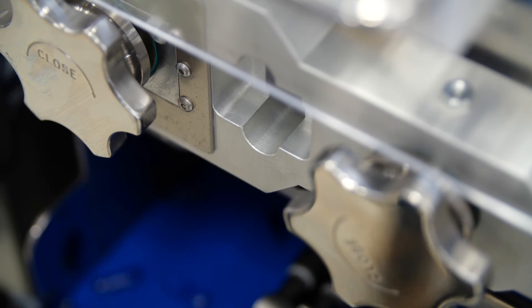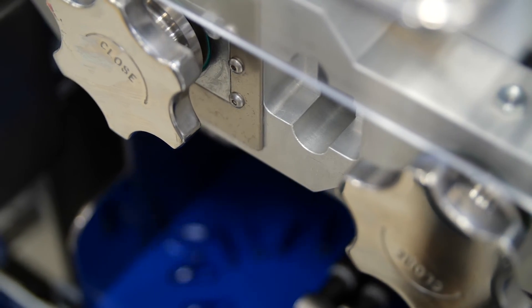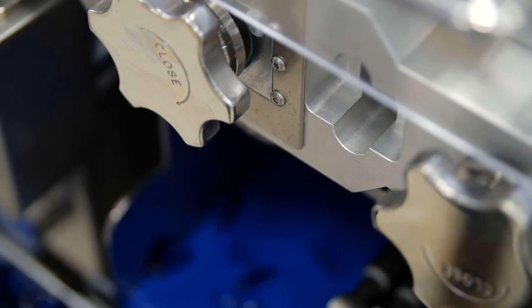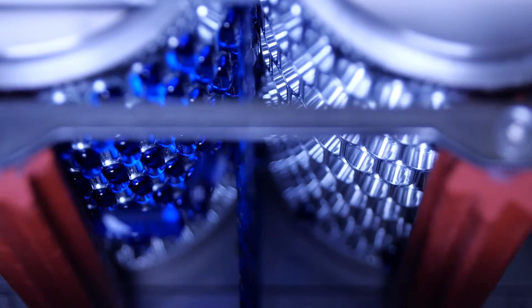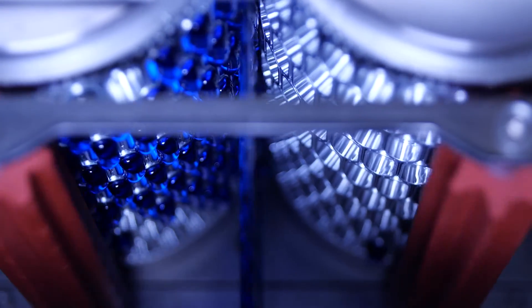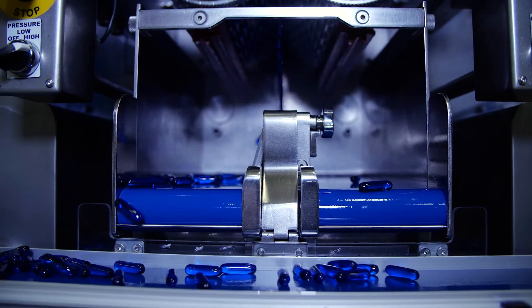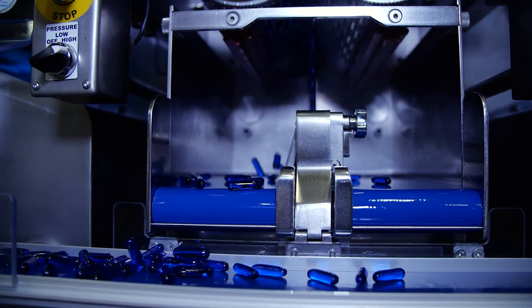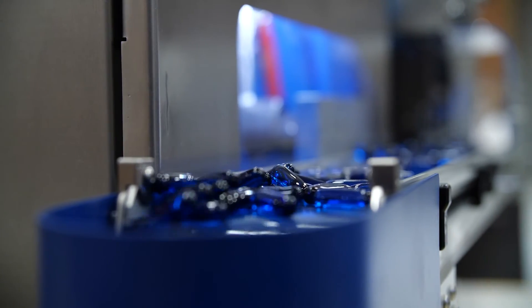Then, the pressure between the rotation dies, which is adjusted using the PLC screen, cuts the ribbon, and the formed and filled soft gelatin capsules fall onto the machine's conveyors, which direct the capsules away from the machine and towards the drying equipment.